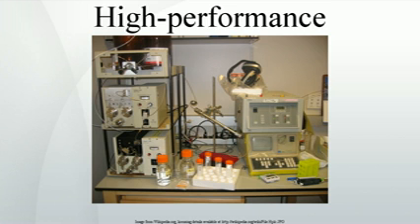This layer changes with any changes in the composition of the mobile phase, for example moisture level, causing drifting retention times. Recently, partition chromatography has become popular again with the development of HILIC-bonded phases, which demonstrate improved reproducibility, and due to a better understanding of the range of usefulness of the technique.